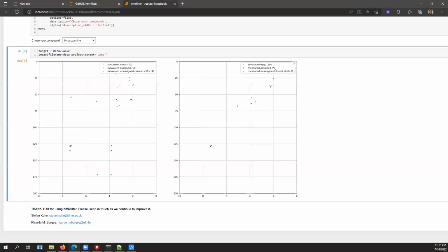I have 9 of the 10 expected peaks. They're matching, and some of the HMBC are matching as well. You can see the connections going on here in the HMBC. This is as expected. Okay, so I have the identification of this compound, and I can even see quaternary carbon for the identification, which is great, right, in many cases. Okay, so this is it.